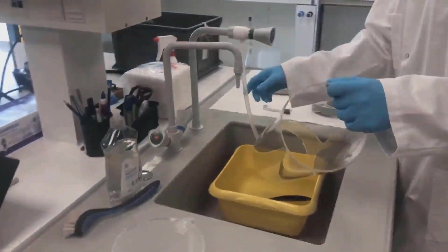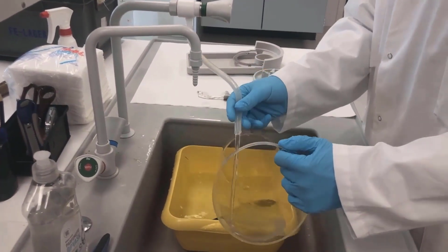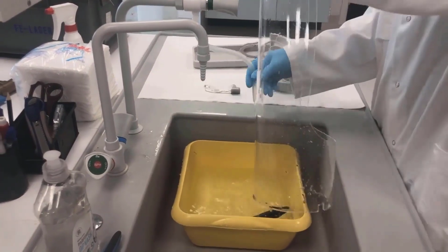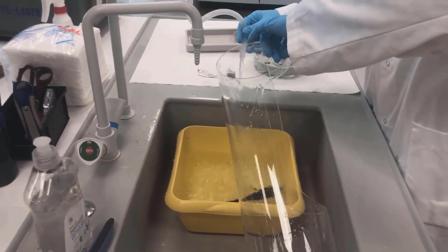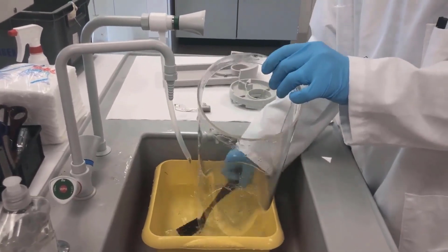Okay, it's the same way: you just wash the safety door with water and some neutral detergent, not a solvent, alkyl, ethanol or some other organic solvent. It's important to use a neutral detergent or just water.